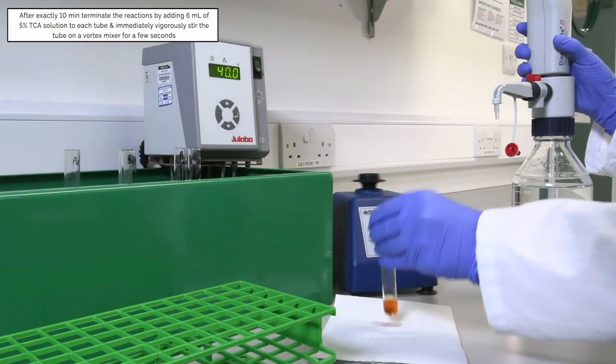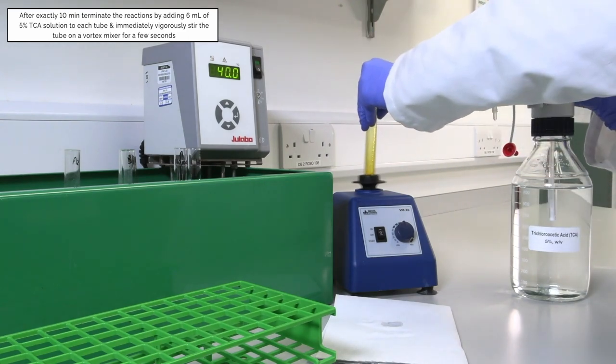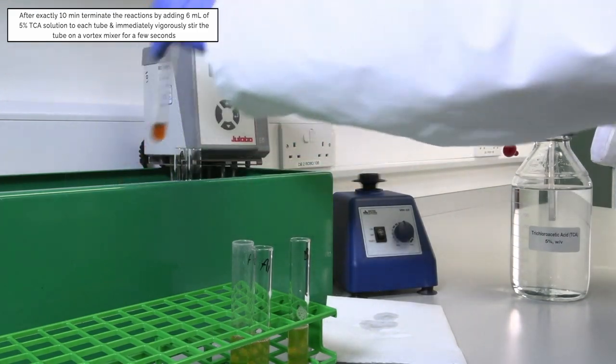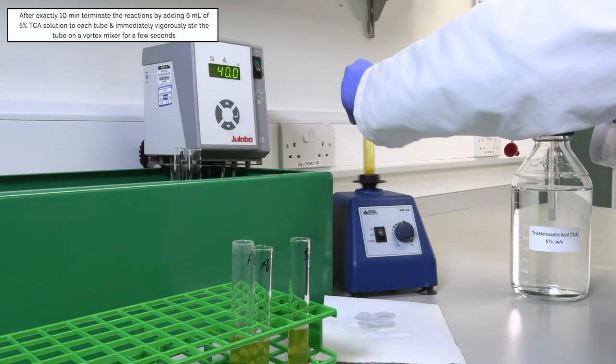After exactly 10 minutes from addition of the enzyme to each tube, terminate the reactions by adding 6 ml of 5% TCA solution, the precipitant solution, to each tube and immediately vigorously stir the tube on a vortex mixer for a few seconds.